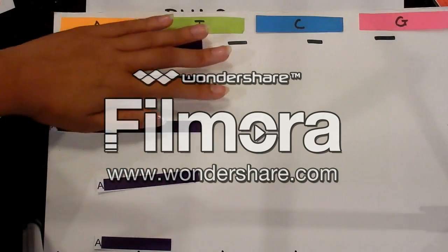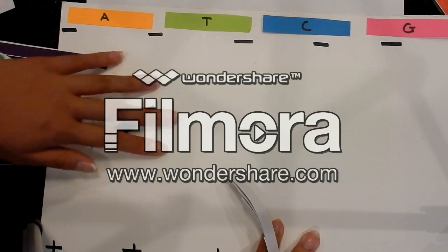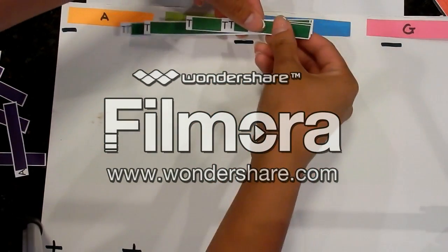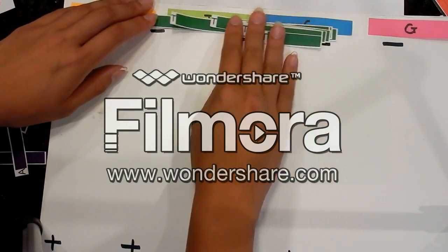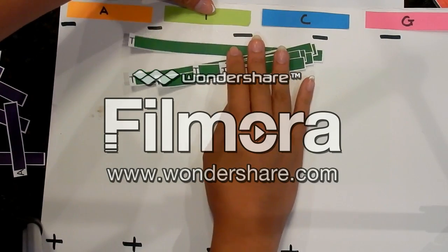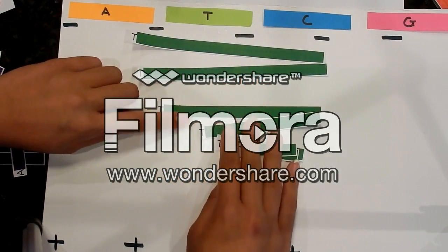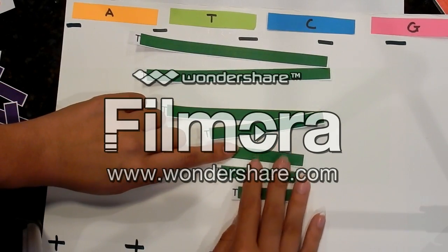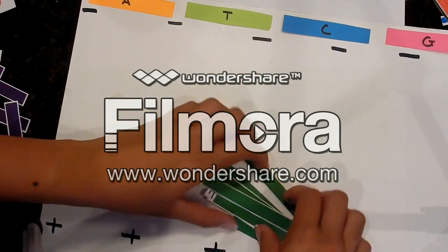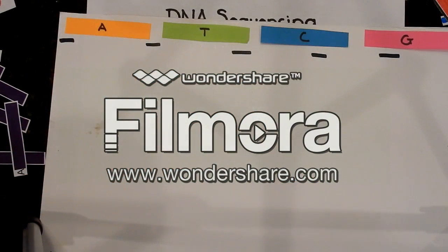And the same goes for the thymine nucleotides. As you can see, we'll start here and then go down. The larger fragments of DNA will stay while the smaller ones keep moving closer and closer to the very bottom. And the same goes for the cytosine and guanine dideoxynucleotides.